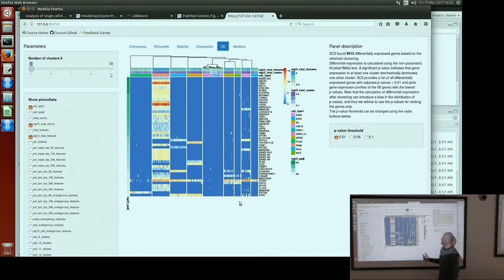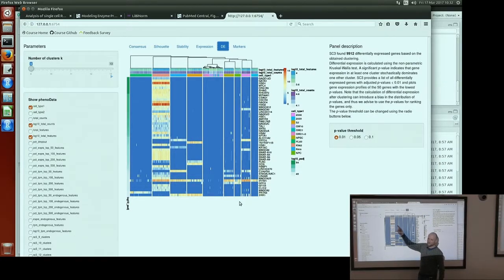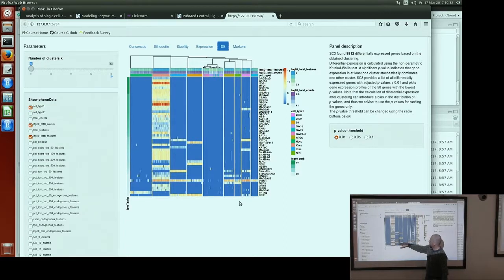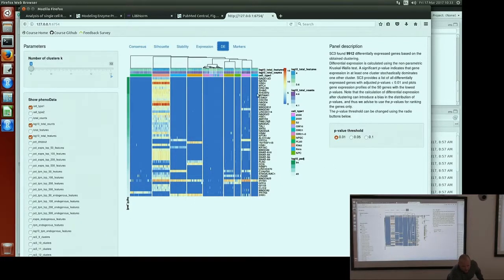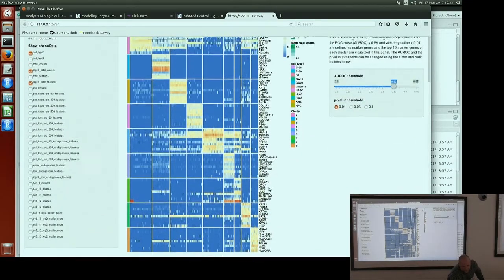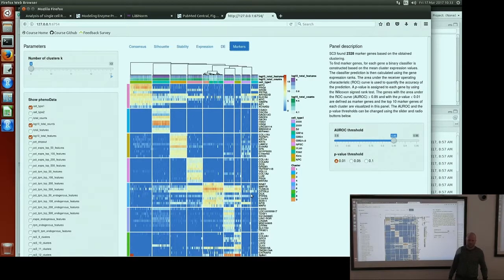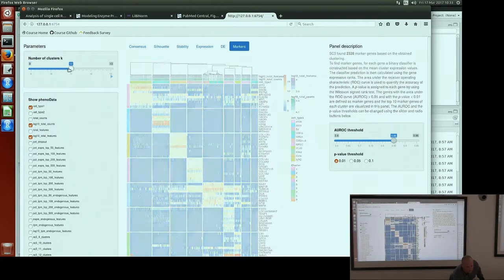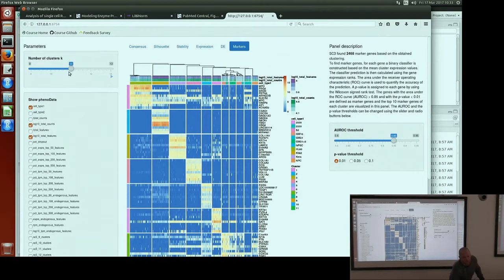Differentially expressed genes — if there is at least one difference between any two clusters, it will be reported as differentially expressed. Obviously you get all marker genes as differentially expressed genes as well, because there is a difference between one cluster and everything else. But you also have genes expressed in some clusters and not in one or two others — these are not marker genes but are differentially expressed genes. If you change k, you can see how marker genes change as well. Because all biological information is pre-calculated, it doesn't take any time to plot.